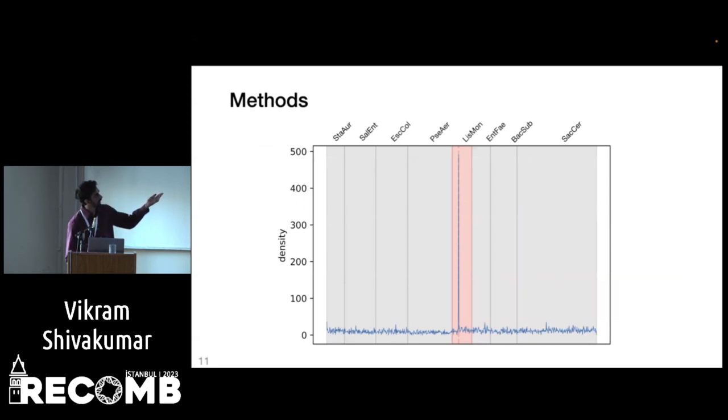And as you can see here, what we call a Manhattan plot is a concatenation of a couple of bacterial genomes and the yeast genome, which make up a mock community in this experiment. And we take a set of MEMs in this single read, and we can get the approximate mapping information, plot them together, and you can see the MEMs cluster very nicely at the true origin of the read, in this case in Listeria, and so we can use this to make our classification decisions downstream.